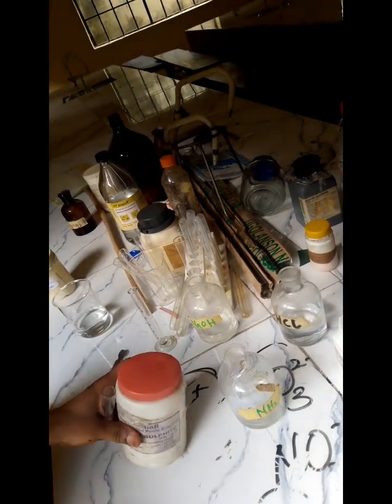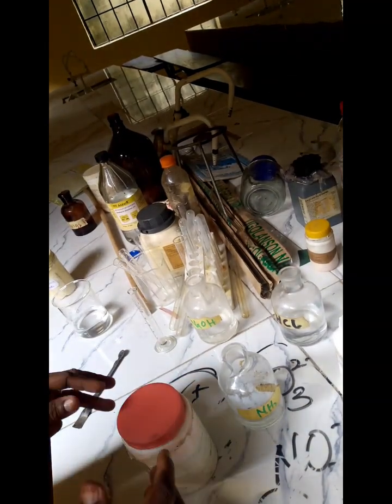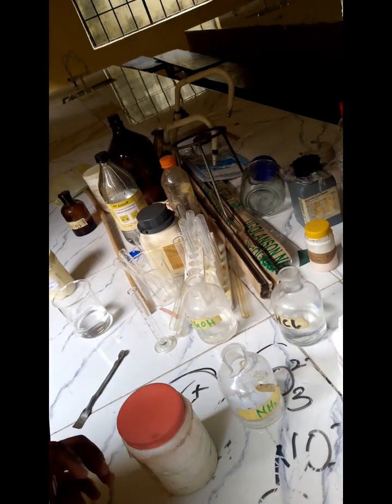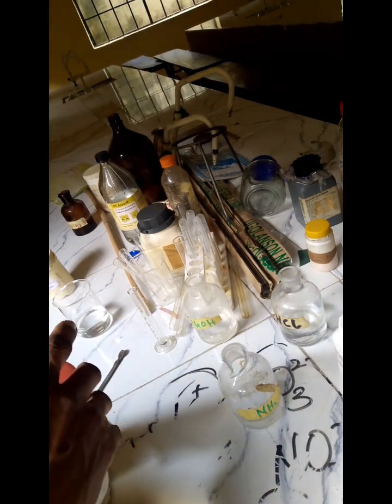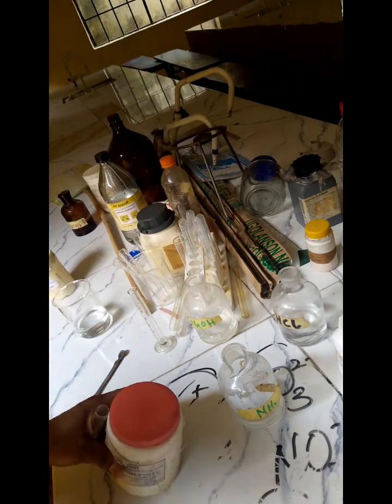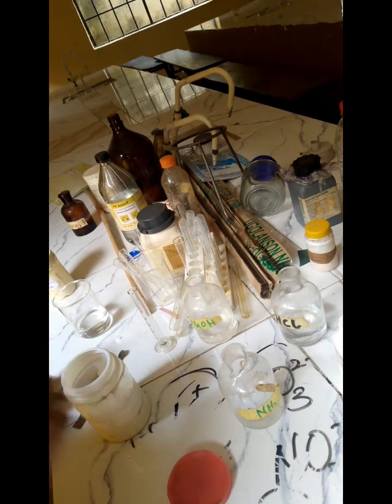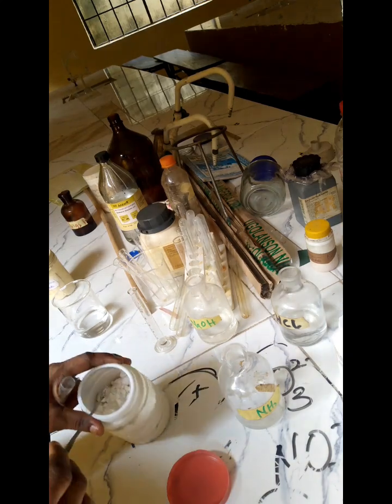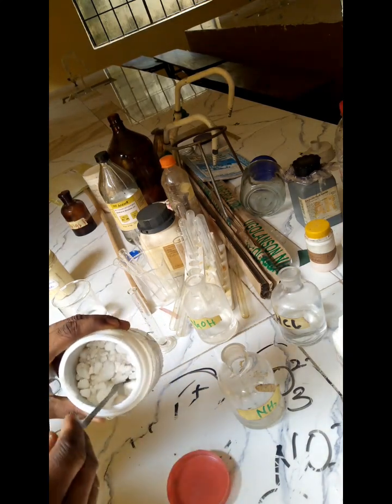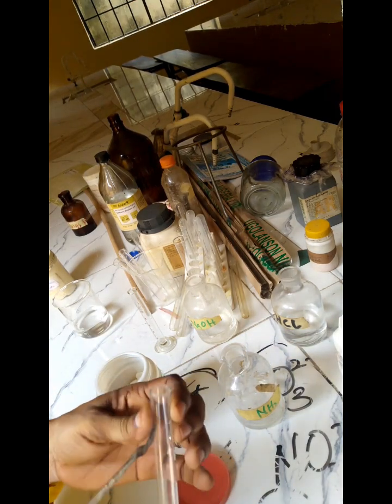Now we want to test the sulfite. Earlier we tested the potassium by means of the flame test. Now we want to confirm the presence of the sulfite ion, SO3 2-. So let's collect a small sample of the salt into a test tube. By the way, the salt is white.